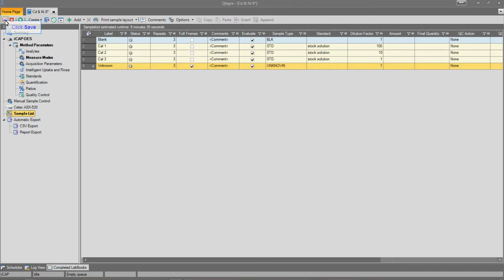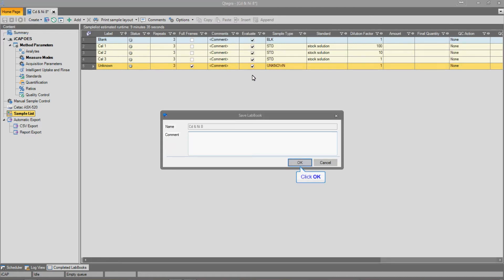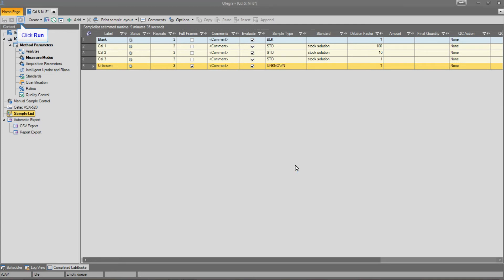Once complete, we then save the lab book and press Run to start analysis.